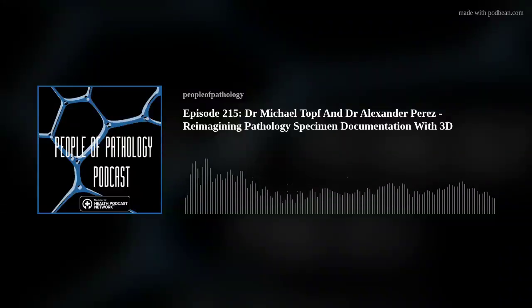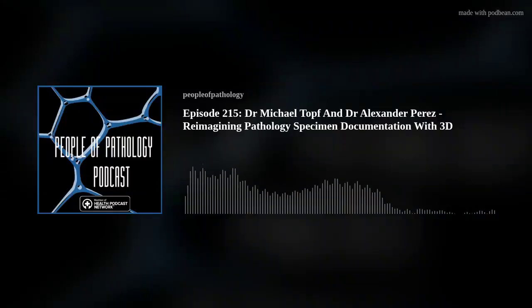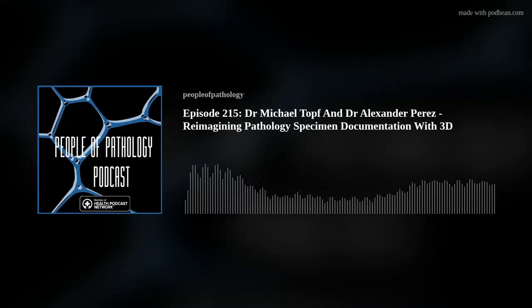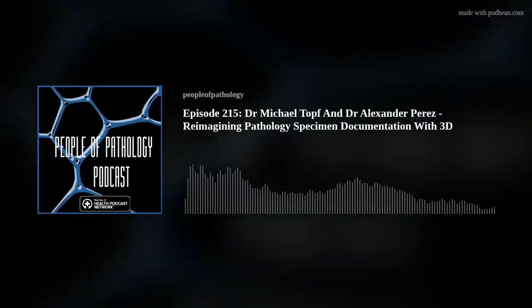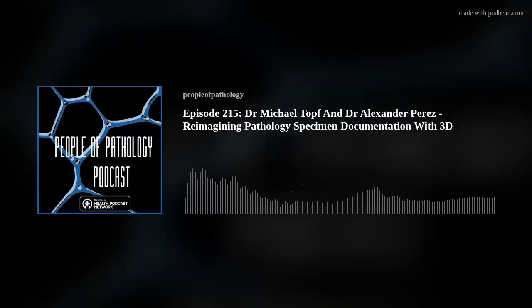And if you have images you can reference, that's great, but there's nothing like seeing the actual specimen. In terms of practicality, it's not always easy for the person who's going to sign out the case to see every gross specimen. People change service weeks, specimens will fall into the following week, or whatever. But one thing that's durable is the 3D scan. If you make one, that can exist in perpetuity, and then anyone can look at that when they're signing out the case. So that was really my biggest initial interest in this.